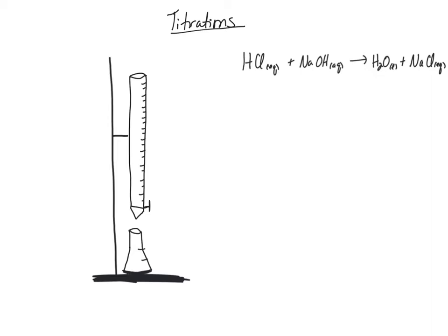And I think that's rather apparent from what you now see here as a typical titration setup that you'll see in the lab. So this right here is known as a burette. And down here we have an Erlenmeyer flask. And this is just a ring stand. So in other words, something to stand up both the flask as well as the burette that's up there.